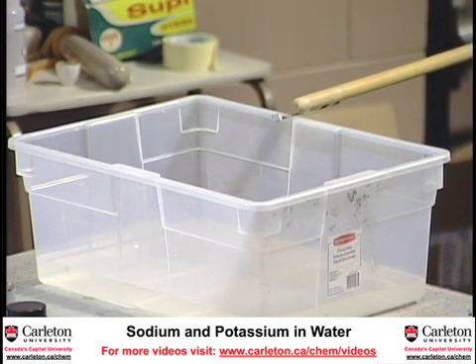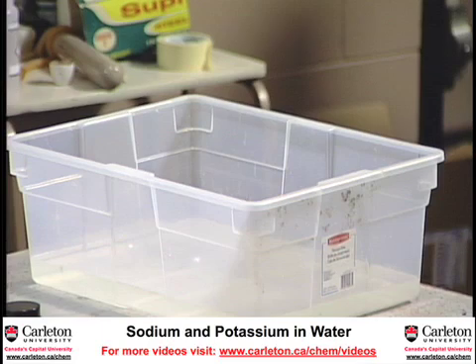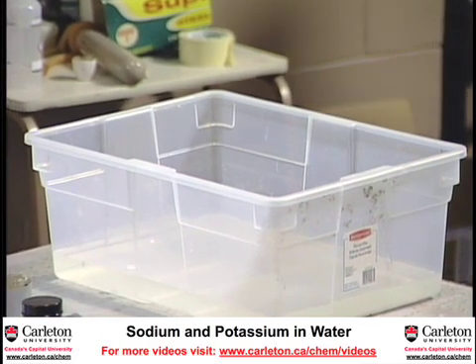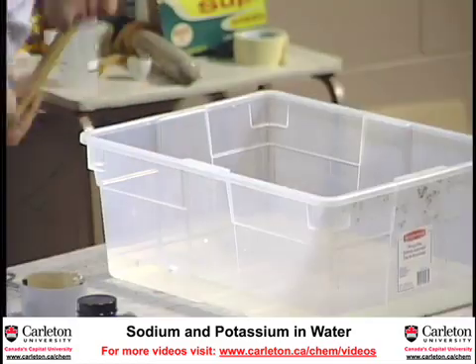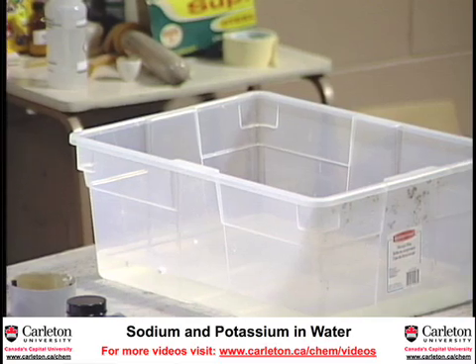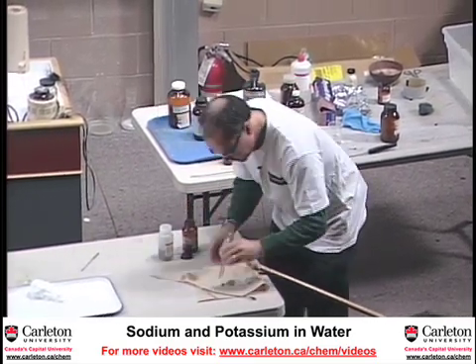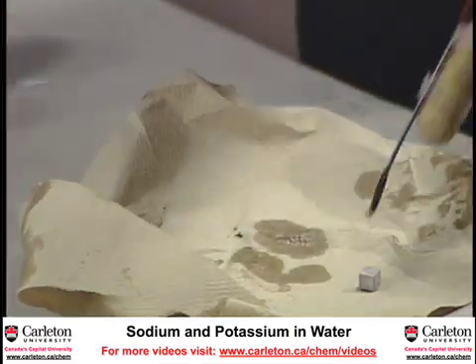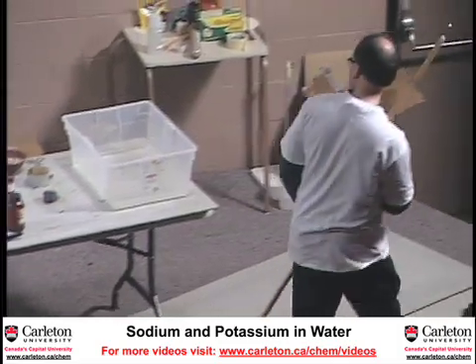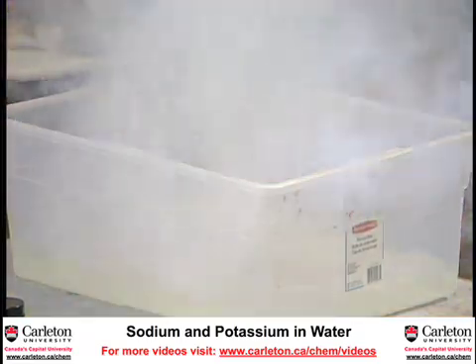I'm just going to drop this piece of sodium into water. So it's hissing and spitting. I think we need a bigger piece. We'll take the oil off it so the water can react with it. We'll drop it in. There we go. That's what I wanted.